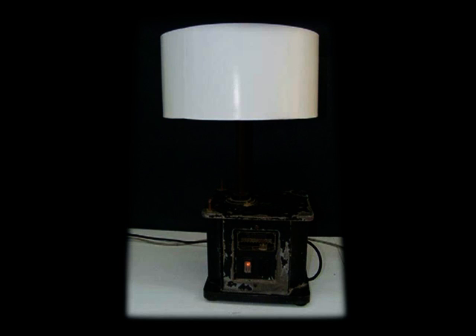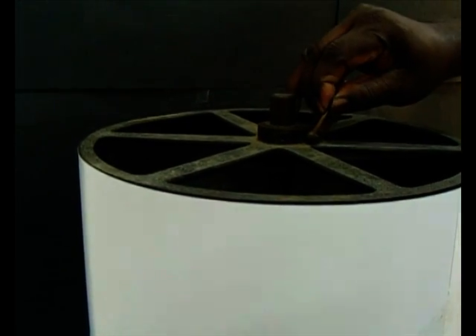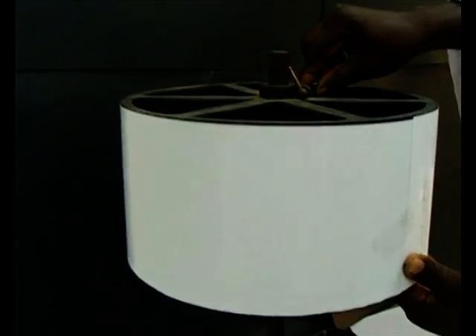The chymograph has a knob at the upper end, which controls the vertical movements of the chymograph drum, on which a tracing paper has been mounted.